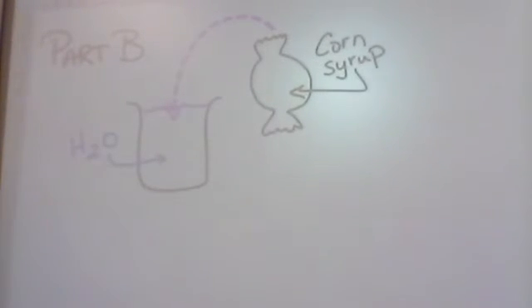Probably outside. Okay. Is it going to move in or out? Well, hopefully not. Group D, what do you think? Which direction is the water going to move?